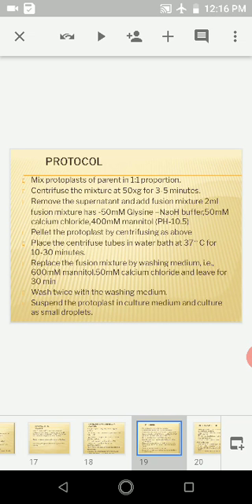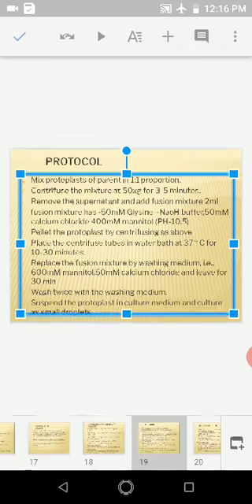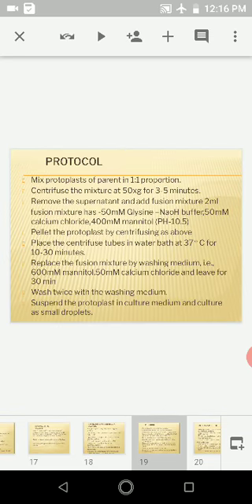Place the centrifuge tube in a water bath at 37°C for 10 to 30 minutes for incubation. Then replace the fusion mixture with washing medium — 600 millimolar mannitol and 50 millimolar calcium chloride — leave for 30 minutes, wash twice, and suspend the protoplasts in culture medium.